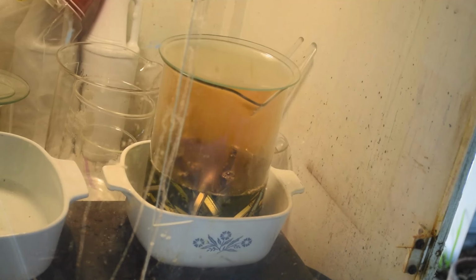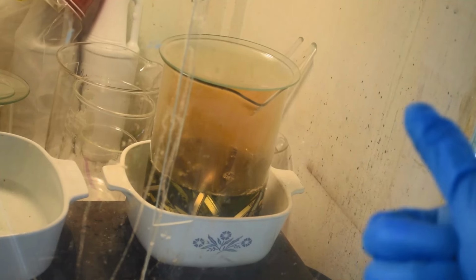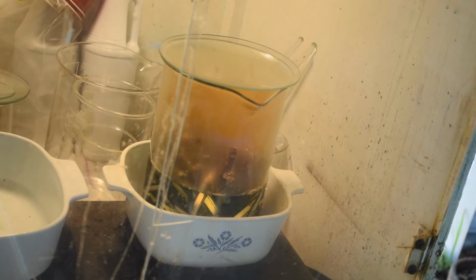And in the meantime, I'm going to make up a fresh batch of stannous chloride solution because I've been gone for a month. I don't trust my old stuff. And we will test it and see what we got. In fact, I'll put a link to how I make my stannous chloride solution in the upper right too, so you can check that video out if you like.